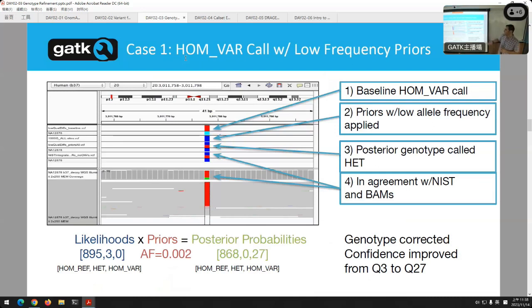Look at the allele balance. It's all weird. Good? Okay. So let's say, though, I have priors now. Let's say I know that the red is the prior.